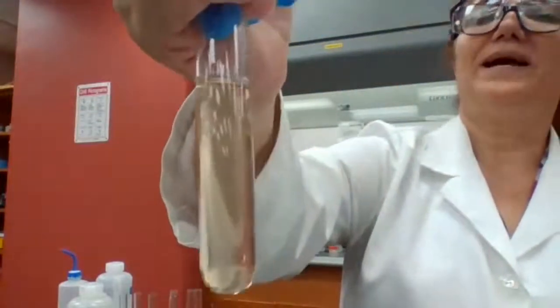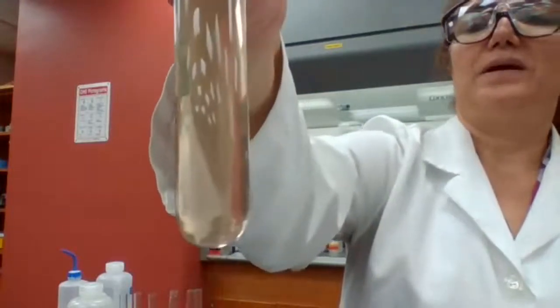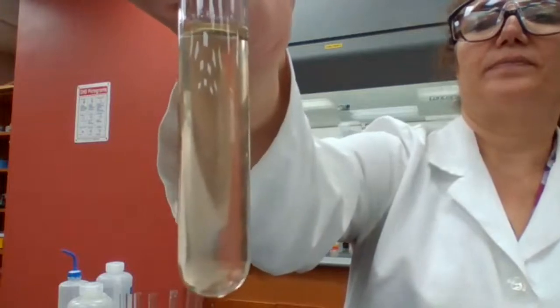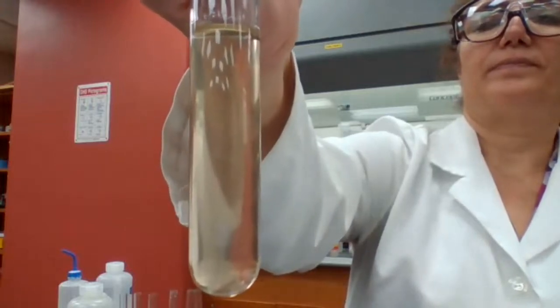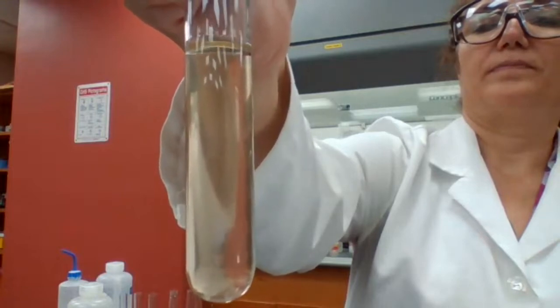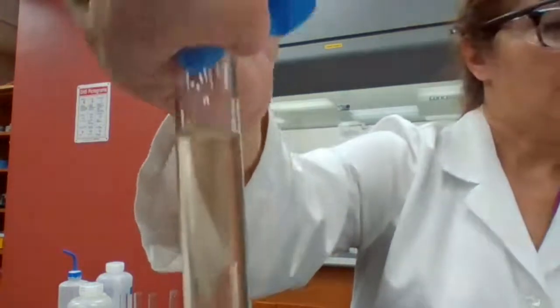So this is after adding HNO3. It's all clear now. Okay? After adding HNO3, it's all clear.